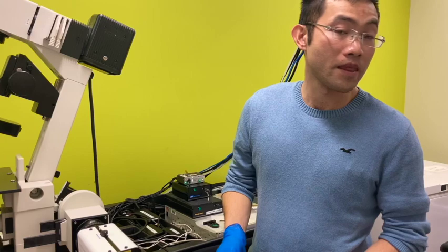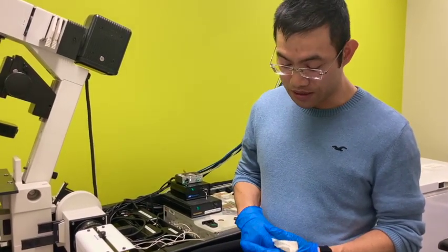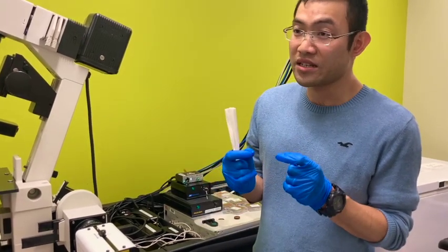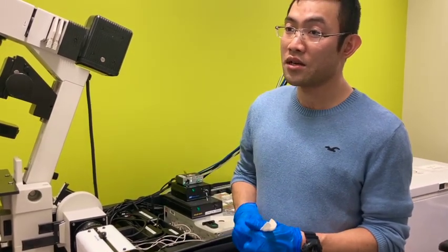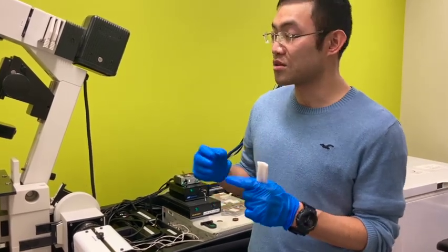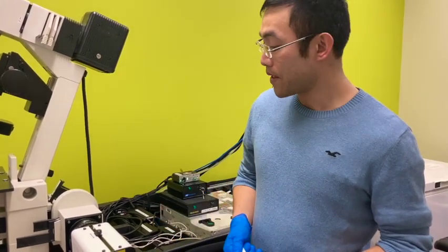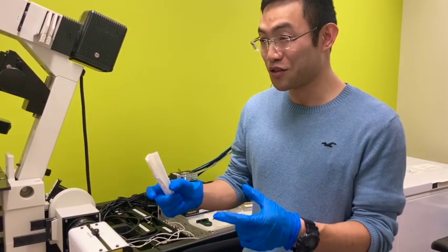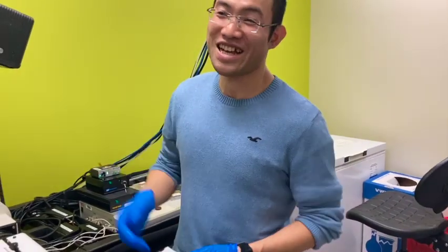Which means if we are imaging our microtubule, we should use blue. That's the better one. But if you are doing gold nanoparticle imaging, because gold has resonant absorption of green light, green light is better for gold particle tracking. Gold particles have resonant absorption at around 530, so green light for gold particles. And if you want to check gold particle-labeled motors working on microtubules, then you can do it there.